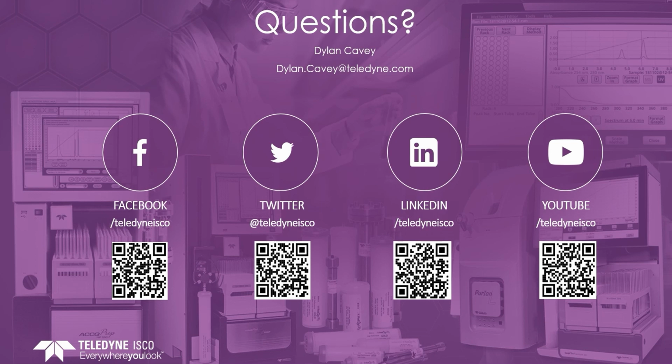Another question is, when might you use a stepped gradient compared to a linear gradient? For that, we can use an example. Let's say we have a compound that elutes at 5% of your strong solvent, and you have another compound that elutes at 50% of your strong solvent. If you run a linear gradient, that's going to take a lot of time, and a lot of solvent, just to wait for that second compound to elute at 50% of your strong solvent. Instead, you could do an isocratic hold at 5%, allow that first compound to elute, then increase your gradient and have another isocratic hold at 50%, and then your second compound will elute. That's going to save you a lot of time and a lot of solvent.